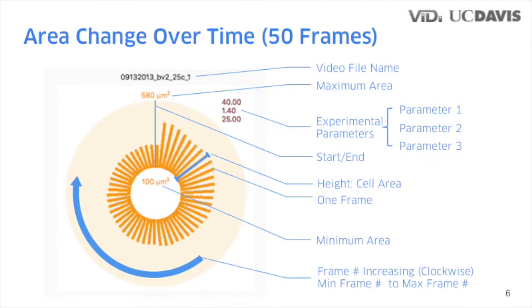Now let's take a look at the visualization of each cellular feature in detail. We visualize one-dimensional features such as area and perimeter in a radial bar chart fashion rather than presenting them horizontally. In this way, the radial layout is more compact. It saves more screen space when putting multiple visualizations side by side for comparison. The other reason is it's easier to control the visualization size to be the same if we normalize the timeline by setting the longest video to form a full circle.